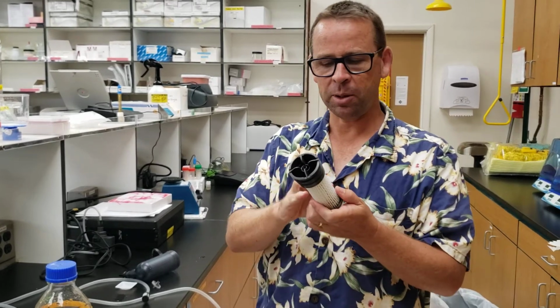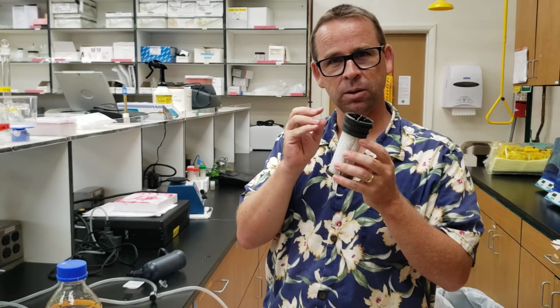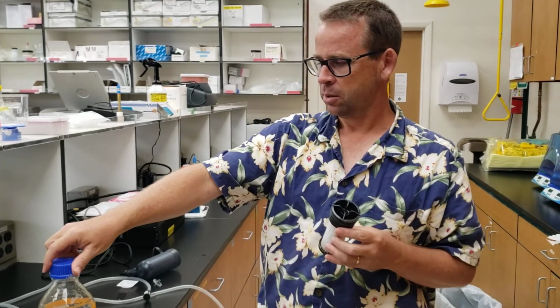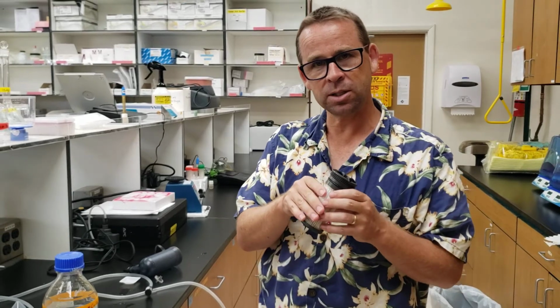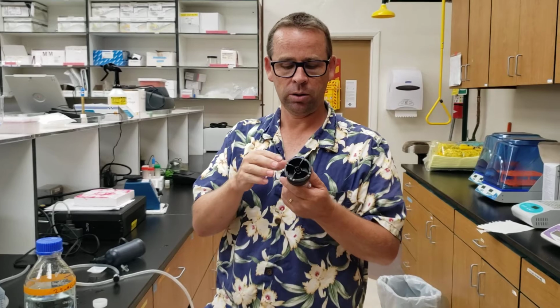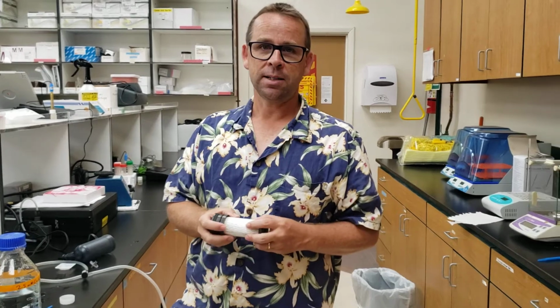And I think what happened was that from my first time I used it to see if it would bind any 2.5 millimolar copper, I feel like there's some in here still. And so when we ran the EDTA through, some of that came out and actually increased the conductivity of the solution. So it's hard to say exactly that any EDTA was bound, because we're using the conductivity.